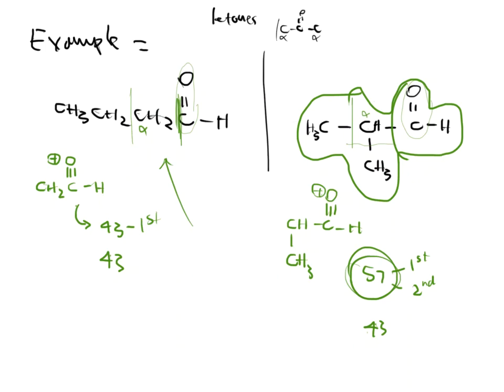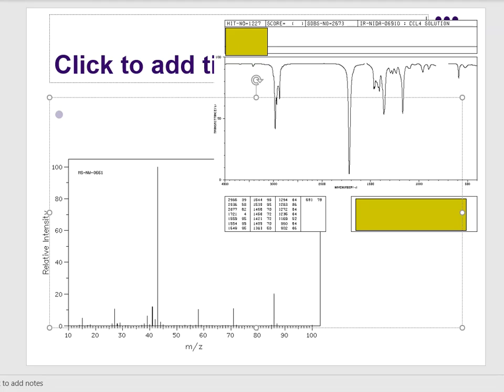Okay, guys, so we're back for maybe one last example on how to pair up an infrared spectroscopy signal with a mass spectroscopy signal. And we're going to use those two to identify a molecule. And not only are we going to identify the condensed structure, but we're going to go through and actually give you how those atoms are hooked up. So here's another example. Up at the top, I see the infrared, and then down at the bottom, I see the mass spec.